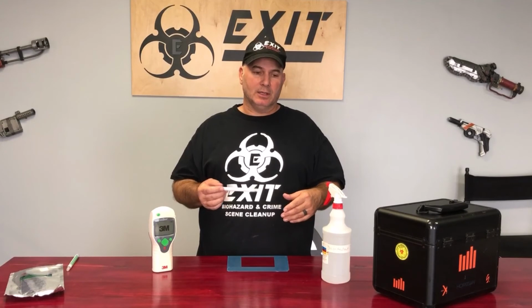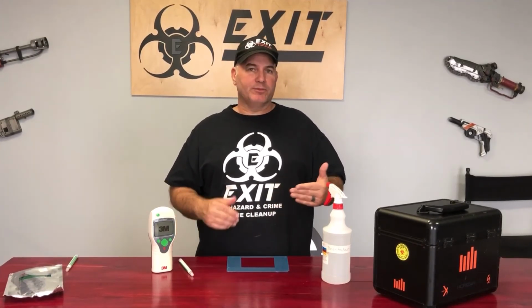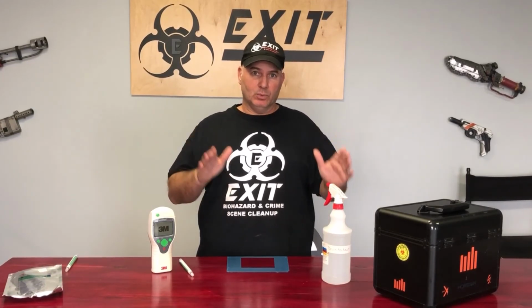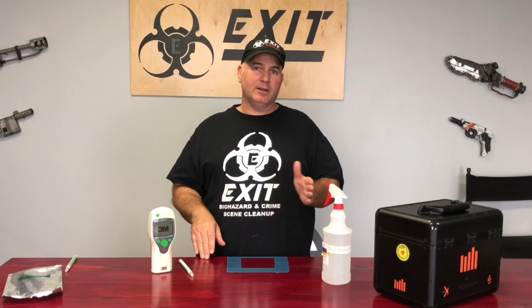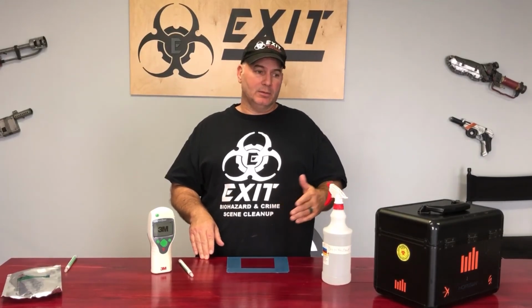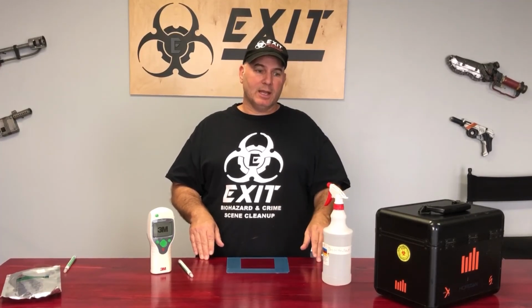You got to use better chemicals or whatever you have to do to get those numbers down to where they can use it. Because honestly, if you're dealing with food prep, that's extremely important to make sure that we bring those numbers down to a standard that is acceptable for health reasons, obviously. So anyway, it's worth checking out.